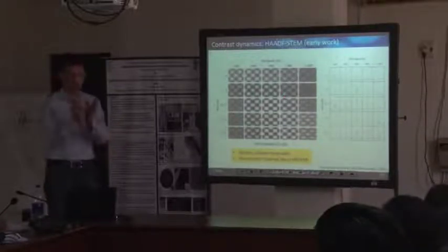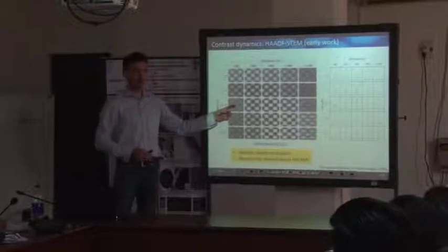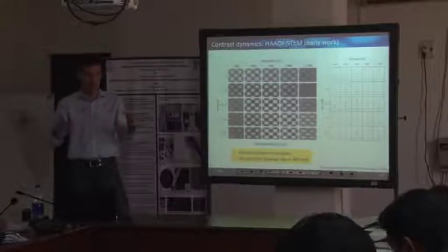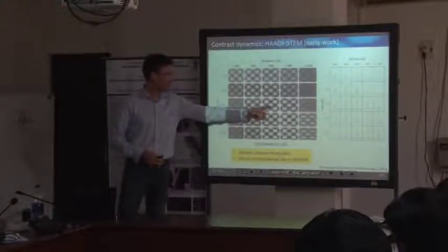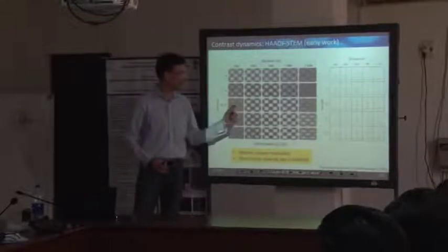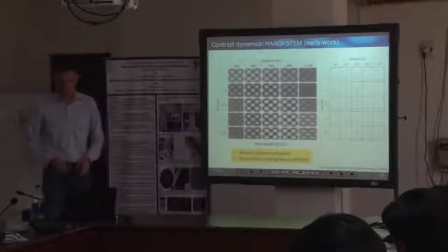If you focus your probe above the sample or underneath the sample, for sure the contrast goes down, because we focus a larger probe, and the effective size of our probe becomes larger and larger if you defocus your probe. This is why the contrast vanishes. But in principle, from under to over focus, there is no contrast inversion.